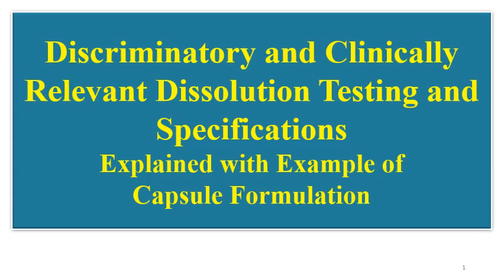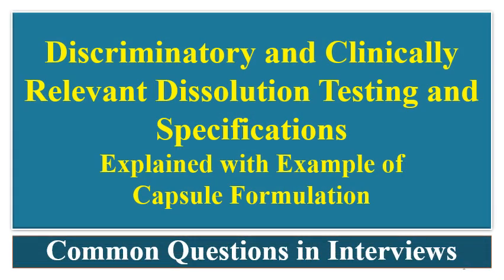Hello and welcome, dear viewers, to another informative video on discriminatory and clinically relevant dissolution testing and dissolution specifications. This video will discuss these two dissolutions based on the example of a capsule formulation, and the capsule formulation is a soft gelatin capsule formulation.